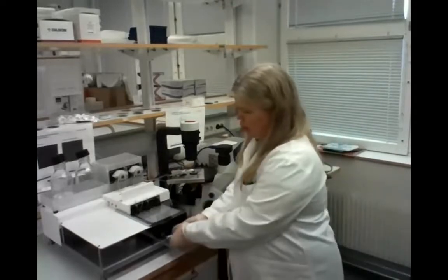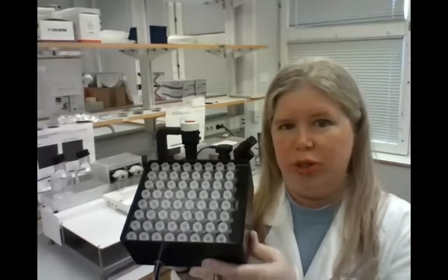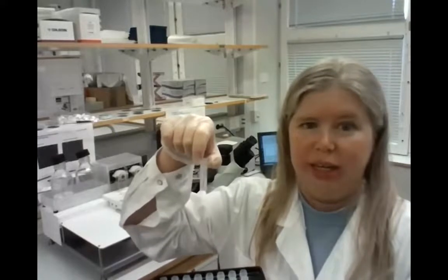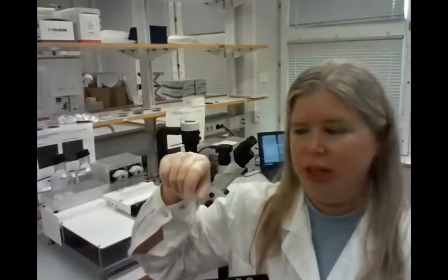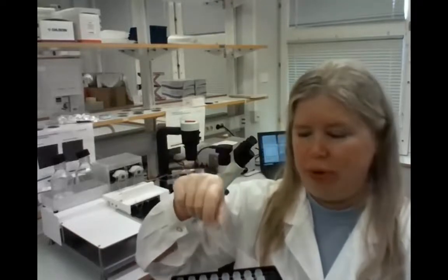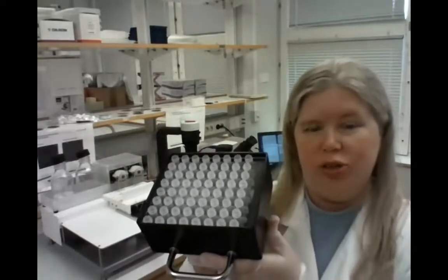And as I said, this could be programmed beforehand. You have this rack with microtubes, so you could use up to 64 samples per experiment, which is really a lot. And those microtubes you could collect from 35 microliters up to 1.8 milliliter, and that corresponds to, depending on the default flow rate, that is 0.42 milliliter per minute, 35 microliters up to some milliliter of sample. So within this, the samples are collected during the experimental time.